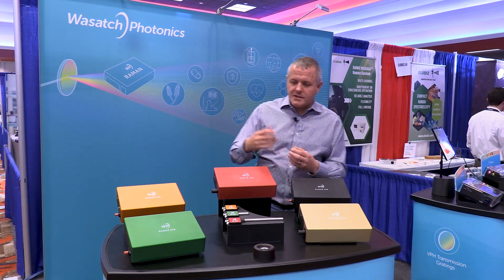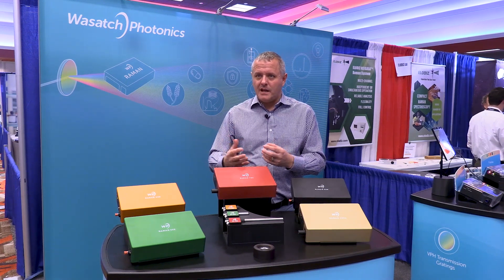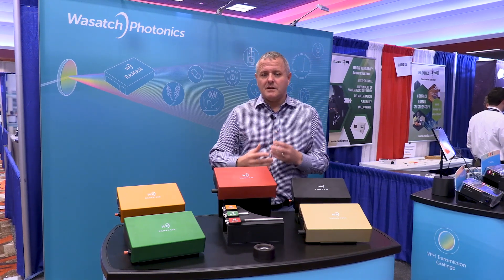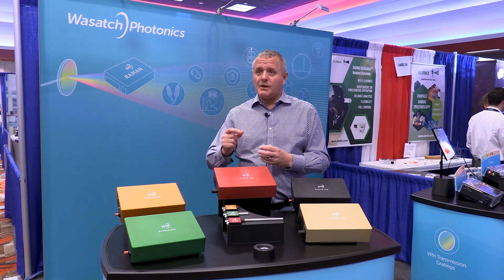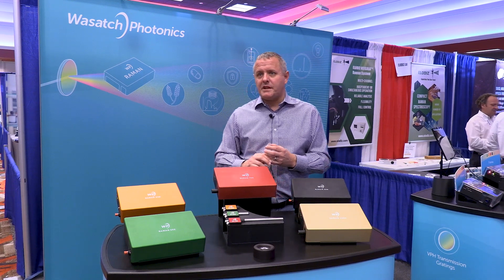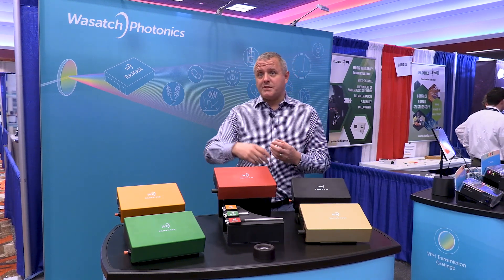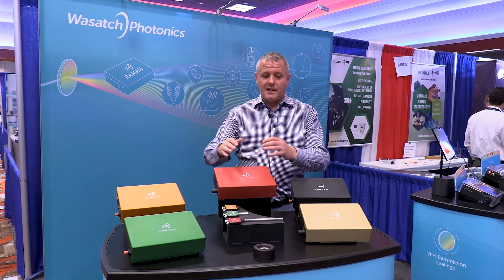Inside this bench we've got one other clever trick. Wasatch is known for that high-throughput design — the f/1.3 — that's great. But some applications require higher resolution while still wanting good throughput, so we have the ability to configure the optics to the f/1.8 design. Whether you want high throughput or optimized resolution, we've got that in there.